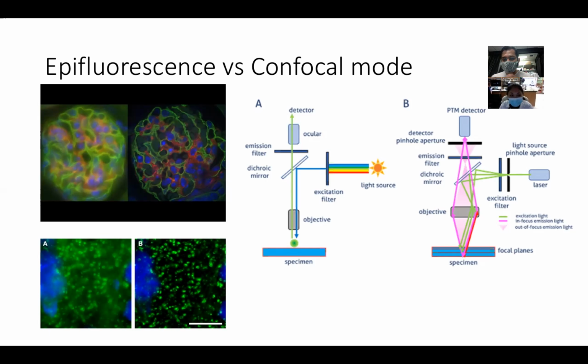Okay, so let's say in future, if you guys are doing some deep tissue imaging, if you have a tumor that you want to image, I mean, if you guys work with liquid tumors? Or you also work with solid tumors? Solid and liquid. Okay, so if in solid tumors you ever want to visualize something deep inside, we can use a multiphoton microscope.